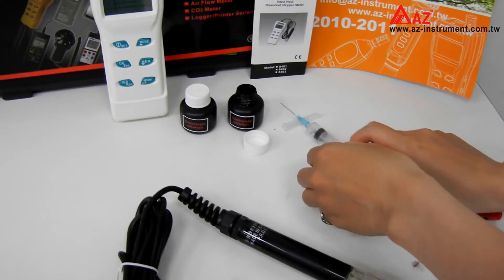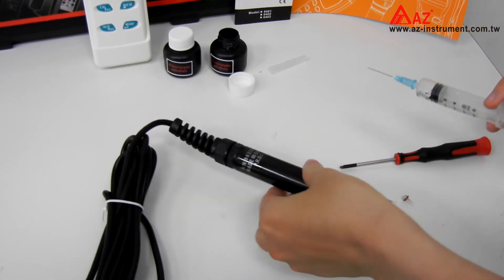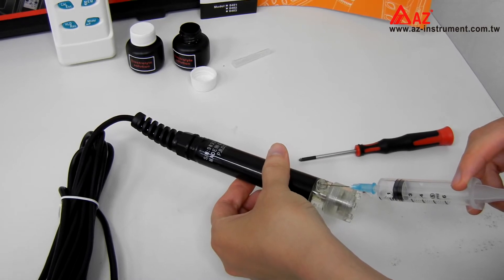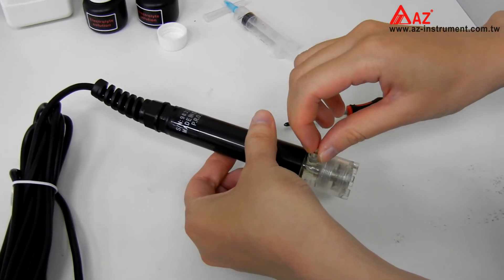Draw some fresh electrolyte with the syringe. Slowly inject the electrolyte into the probe. Be sure to do it slowly to avoid bubbles. Then screw back the nut with the O-ring and washer tightly.